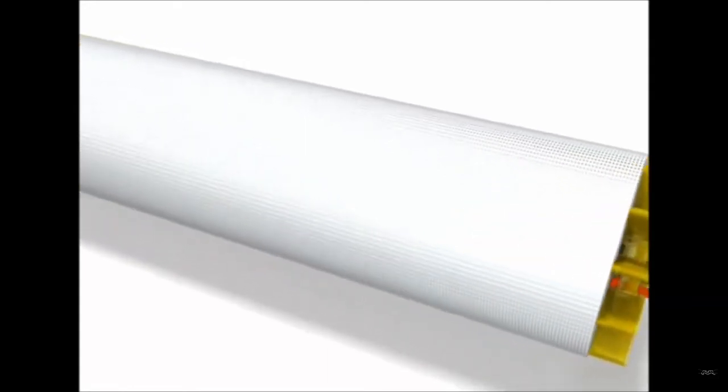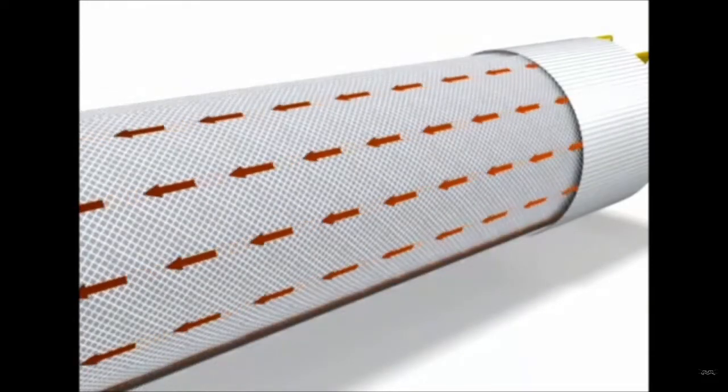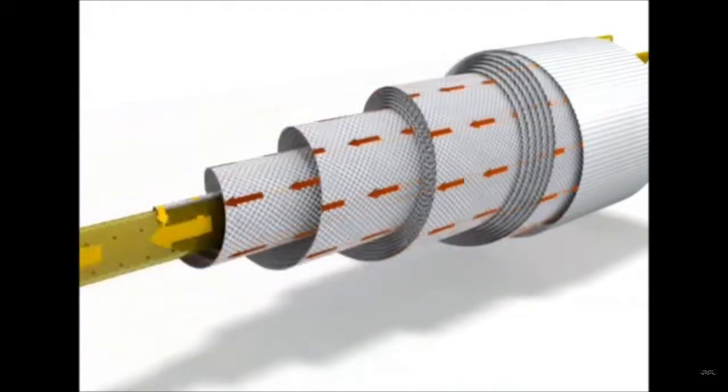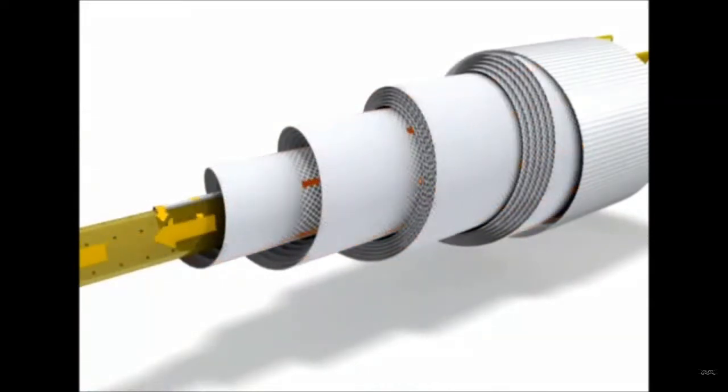As the feed travels down the spiral it becomes more concentrated, illustrated by the increasingly deep red color of the arrows. This concentration effect is due to the fact that the transmembrane pressure—that is, the difference in pressure between the feed and the permeate side—induces a flow of permeate through the membrane layer.